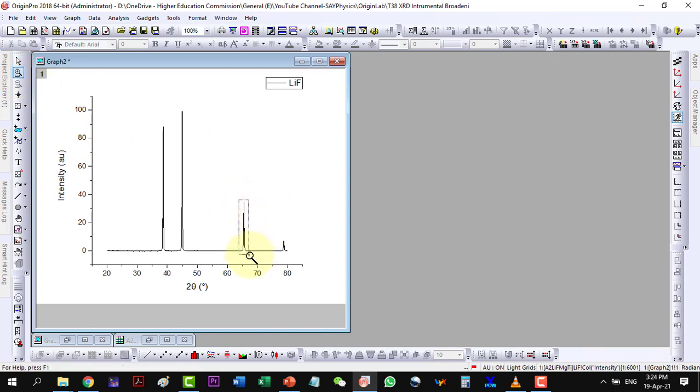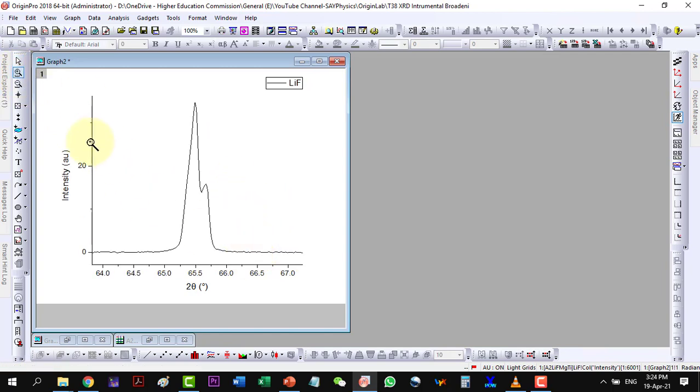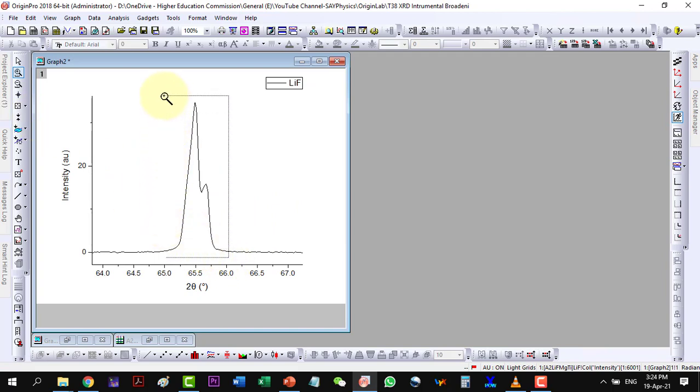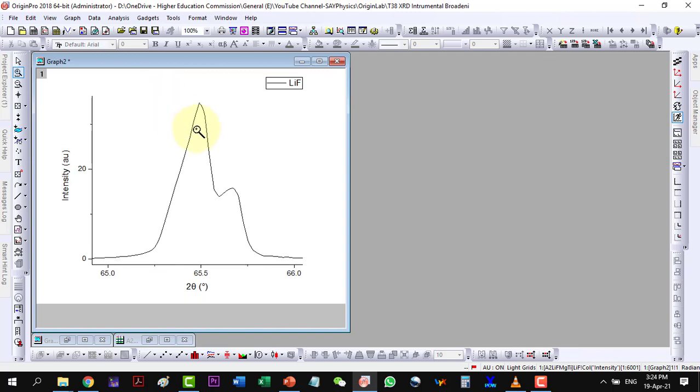Let me focus on the third peak and will show you how the convoluted and deconvoluted peaks affect the accuracy of our calculations. So first, I will fit it in the convoluted form and derive the FWHM value and hence the crystallite size.